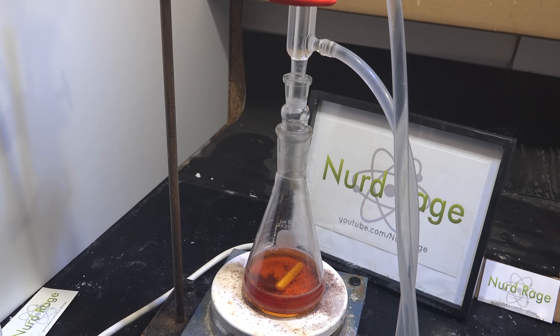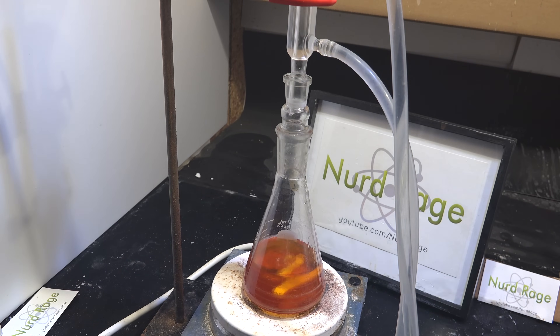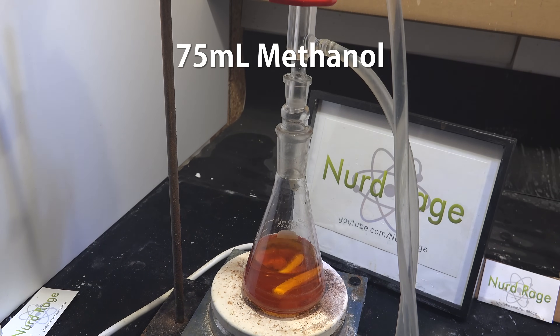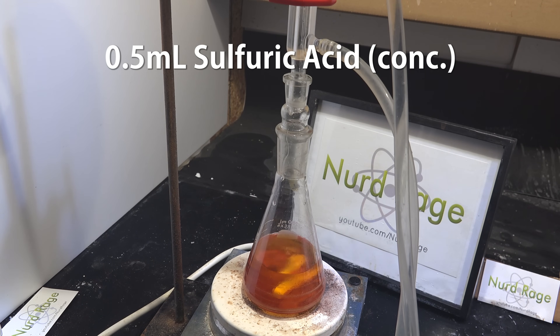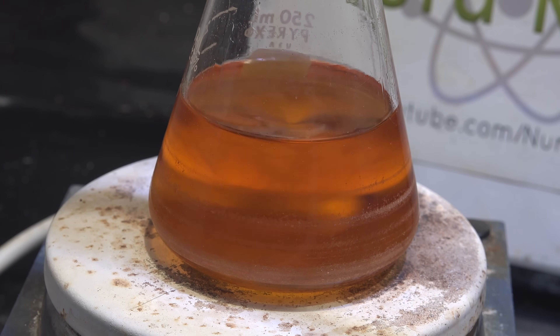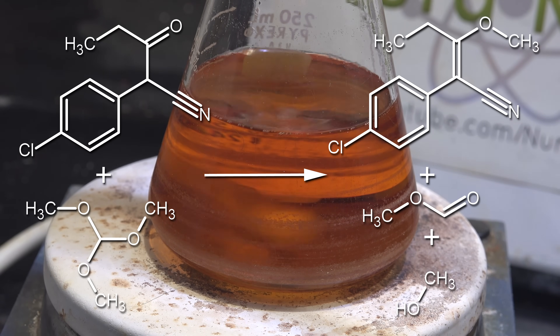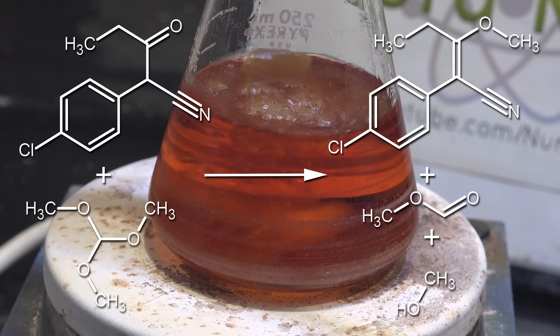Now remove the Dean-Stark apparatus and reassemble with the reflux condenser. Through the top of the condenser, add 30mL of trimethyl orthoformate made in a previous video, then 75mL of methanol dried over molecular sieves, and finally 0.5mL of concentrated sulfuric acid distilled from drain cleaner. Heat the mixture until it refluxes. What's happening is the trimethyl orthoformate is reacting with the 2-parachlorophenyl-3-oxopentane nitrile to form an enol ether.